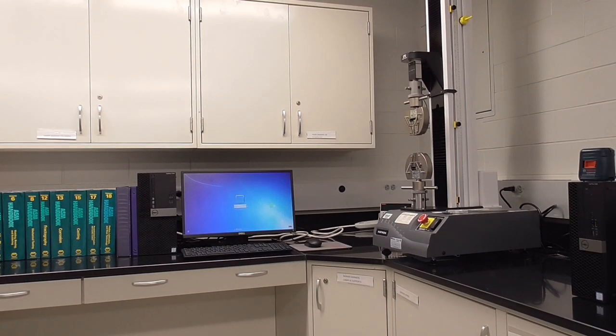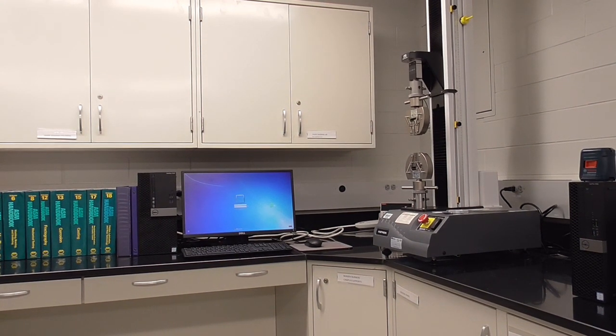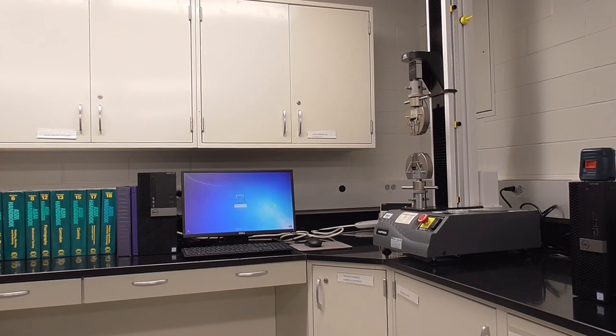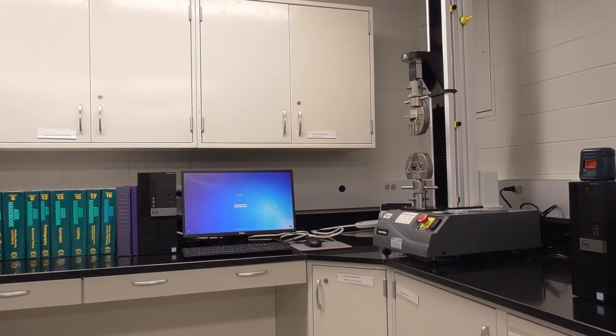Welcome. These are instructions for using the 5 kN mechanical tester for tensile testing.